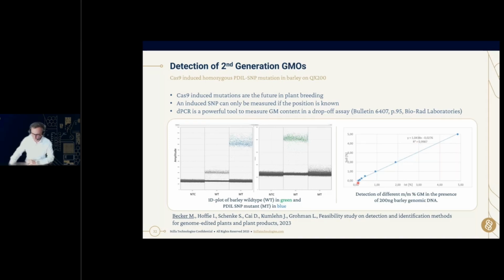This is another thing. Another aim of the study was to find out if CRISPR has some kind of footprints in the background, and if we were able to find other off-target mutations, which wasn't actually the case. So this is also one take-home message from the study, that CRISPR just does its job, at least in this barley plant. Okay, by that I have already finished everything.